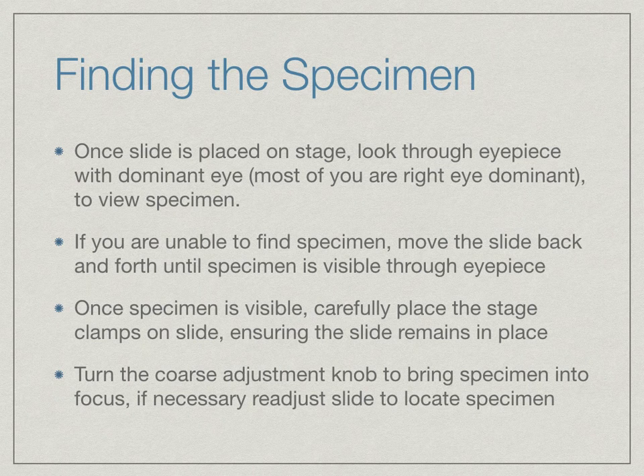If you are unable to find the specimen, move the slide back and forth — forwards, backwards, left, and right — until you can view the specimen through the eyepiece. Once you see or believe you see the specimen, make sure you place the stage clamps on the slide if you have not already done so. Go ahead and turn the coarse adjustment knob to bring the specimen into focus. If necessary, readjust the slide to locate the specimen.